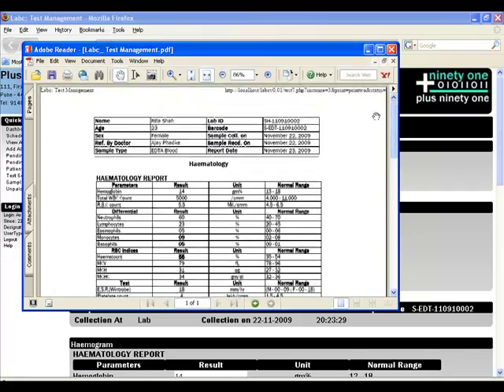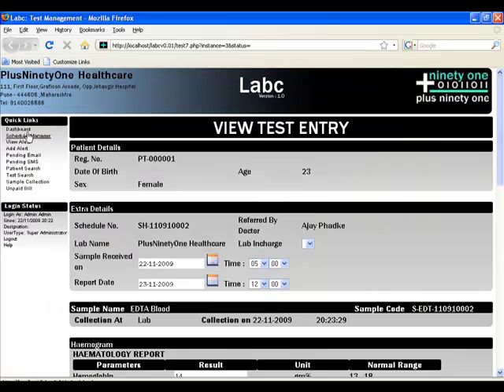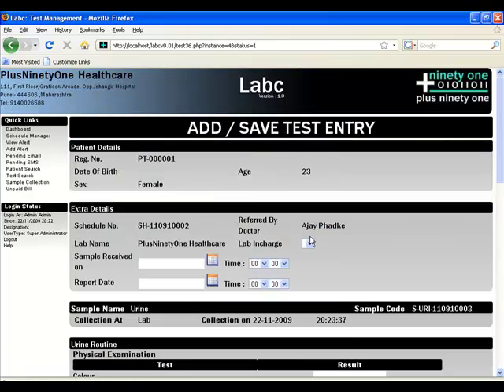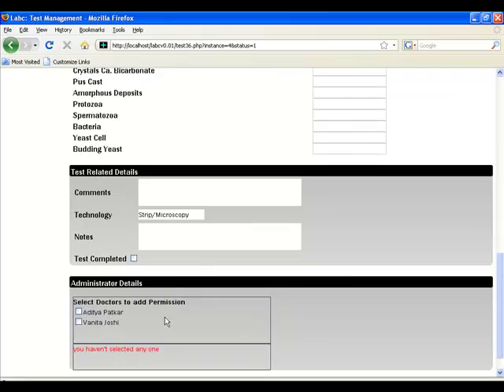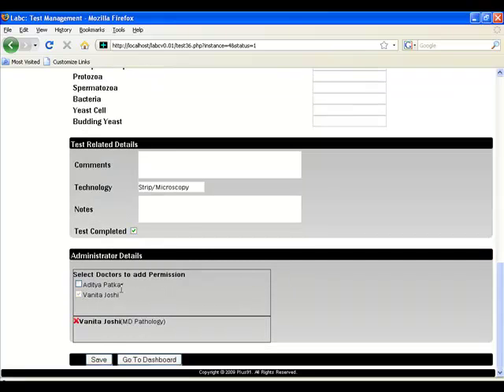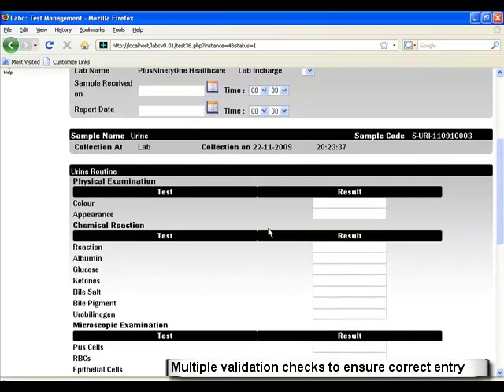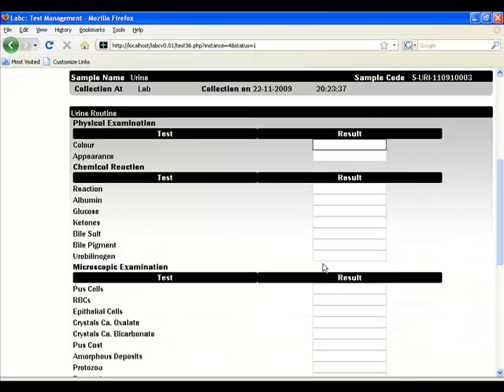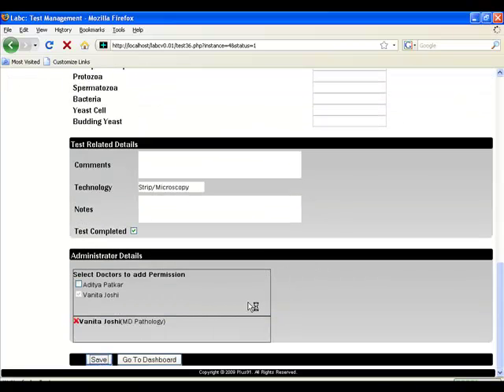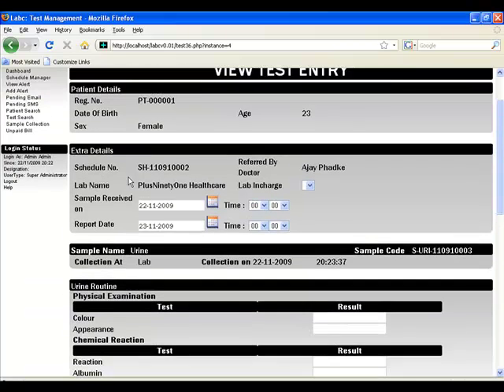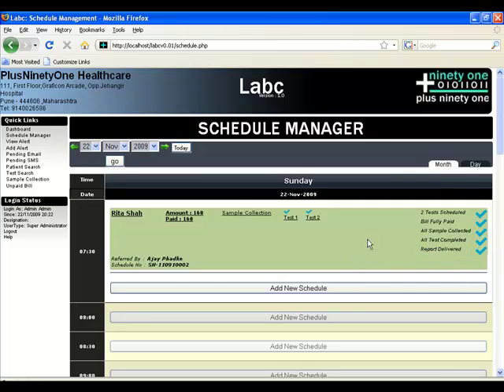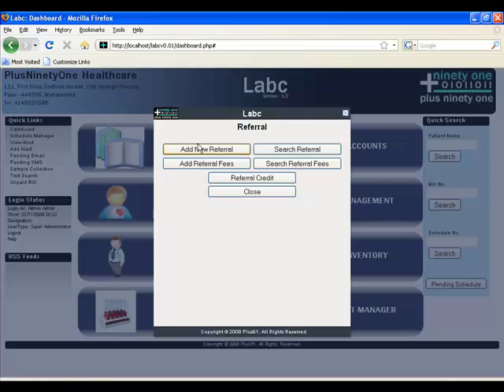This is a sample printed report summary — very neatly and nicely formatted. As you can see, the tick mark has changed from yellow to blue for test 1. Similarly, let's enter test 2, mark it as completed, save, and enter the report date. Once this is done, the entire patient entry status will change. We can press the button to indicate that the report has been delivered, and the process for that given patient is done.